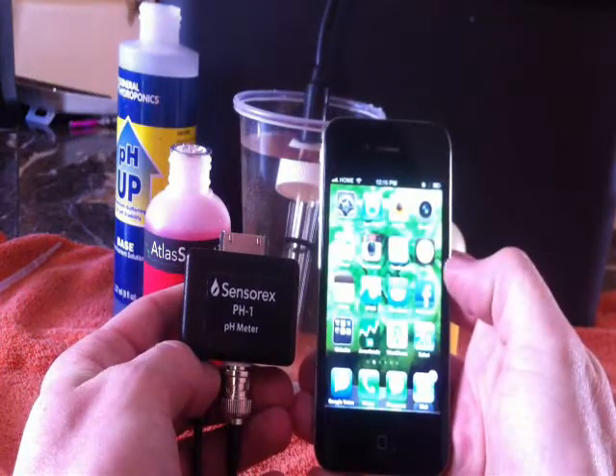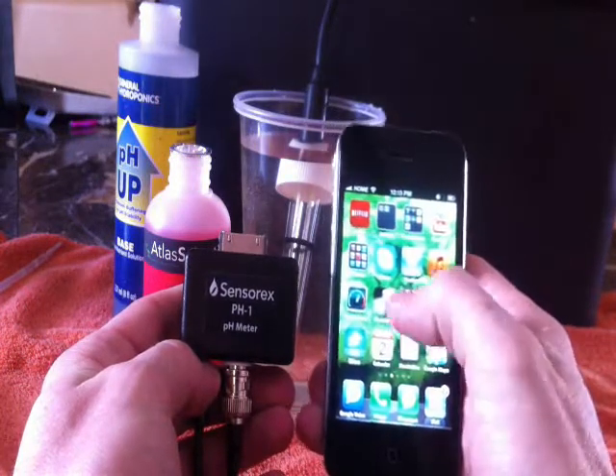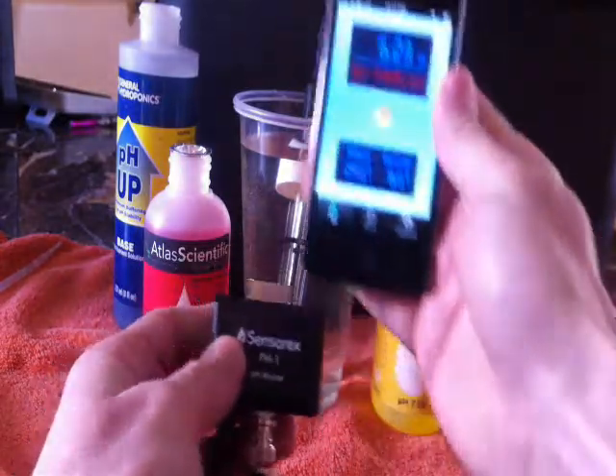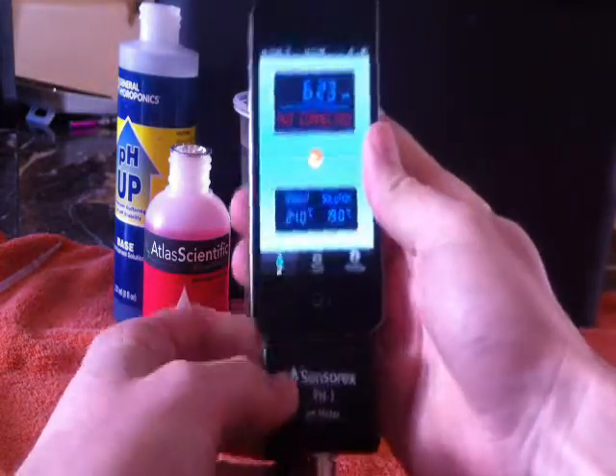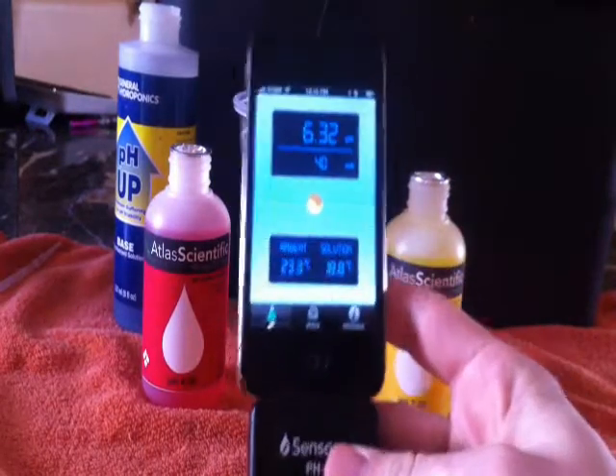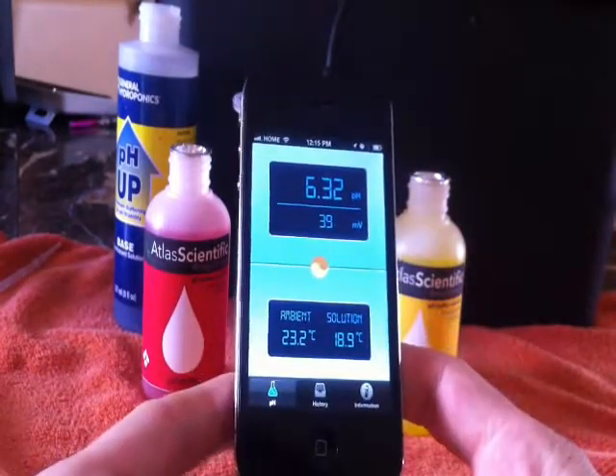You can use any pH electrode with this unit. The electrode that I got also reads temperature, and the temperature settings are built right into the app. The app is free from the Apple App Store, or when you plug in the meter for the first time it will direct you to where to download it.